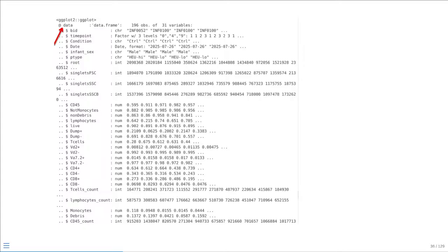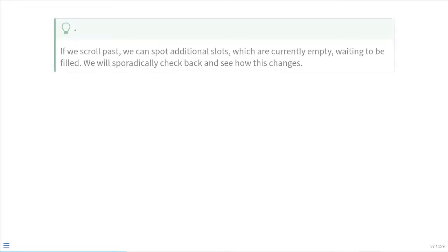In this case, ggplot is stored as what's known as an S7 object. But right off the bat, we can see that the data slot ended up just being filled with our particular data set that we just passed to the plotting object. If you scroll down further, you will see there are additional slots which are still empty, which are where we're going to start filling in additional information being provided to the ggplot as we build out the rest of our plot.